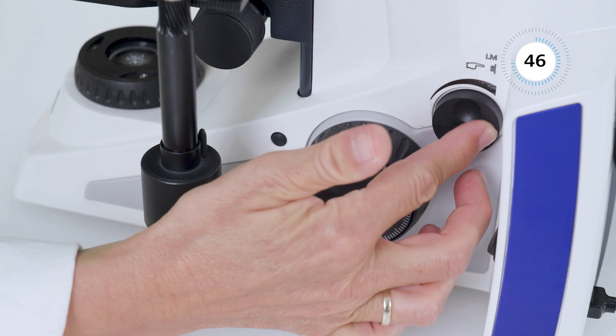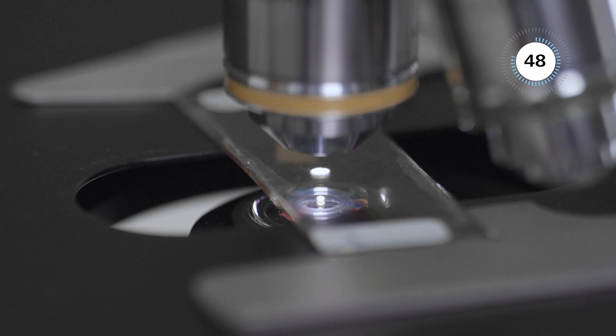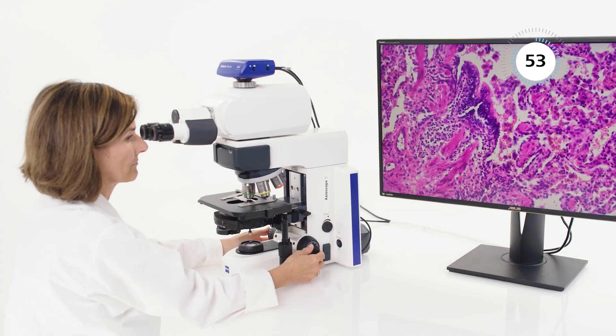The Active Light Manager memorizes the individually set light intensity per objective. You benefit from uniform brightness at all magnifications and reduced eye fatigue.